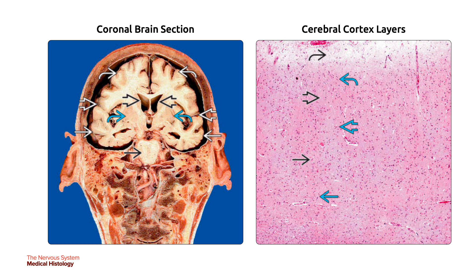On the right is an H&E section showing the six layers of the cerebral cortex between the pia mater on top and subcortical white matter at the bottom: molecular layer (curved black arrow), external granular layer (curved blue arrow), external pyramidal layer (bold black arrow), internal granular layer (bold blue arrow), internal pyramidal layer (single black arrow), and the polymorphic or multiform layer (single blue arrow).